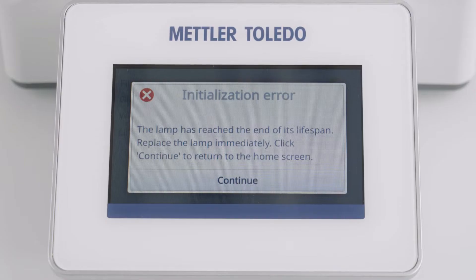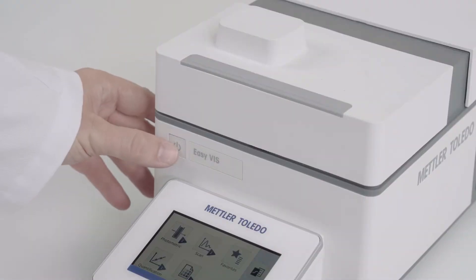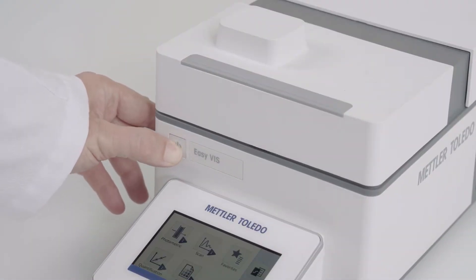When the lamp has reached its lifetime, this pop-up is shown to you. Switch off the instrument and wait for at least 30 minutes to cool down the lamp module.